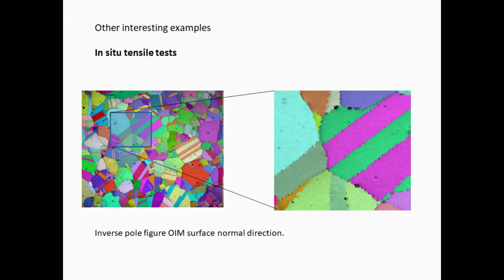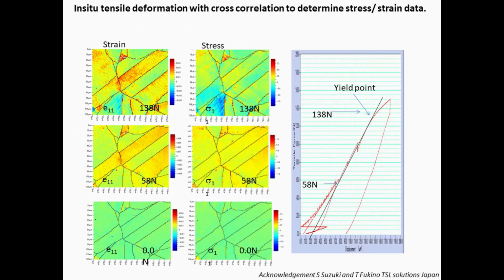I just want to draw your attention to the fact that at the bottom, when you haven't strained it at all, it's all in the green. There is 0 strain. Just a little bit of residual strain in that grain up here and some a little bit down there, but virtually nothing. As you'd expect, it's not strained. But once you start going up the elastic curve, you see we're going into this yellow region here. The strain, so the measured strain is what you expect from the tensile curve.